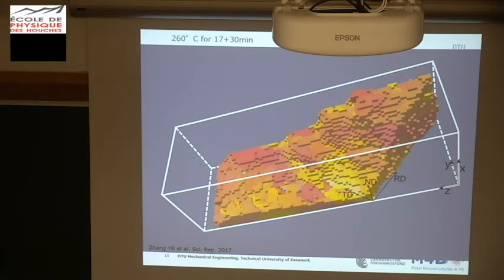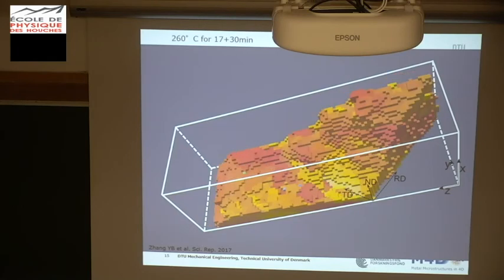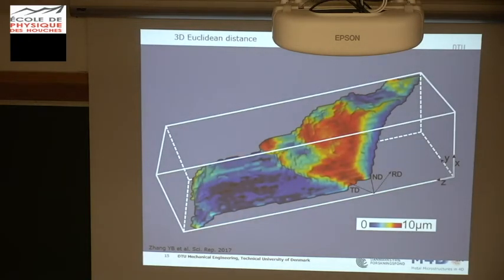And after annealing, you can see that the deformed grain has been consumed. If I flip again, that means the boundary is migrating and consuming the deformation matrix. By correlating the two boundary positions, we can quantify how much each voxel moves during this process. We can clearly see there are a lot of hot voxels that move about 10 microns, and the facet doesn't move much, except here, but this is the motion in connection to the curved part.